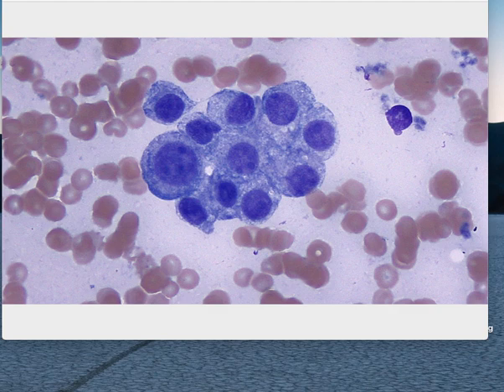The last thing I want to talk about is the thing that we mentioned right at the beginning. The veterinarian wants to know, is this an inflammatory effusion or is it looking more like neoplasia? The sign of neoplasia in effusions is the absence of inflammatory cells. And to be quite honest here, I don't really see any neutrophils or macrophages, right? Instead, there is a uniform population of what we call pleomorphic cells. They are of the same cell type.